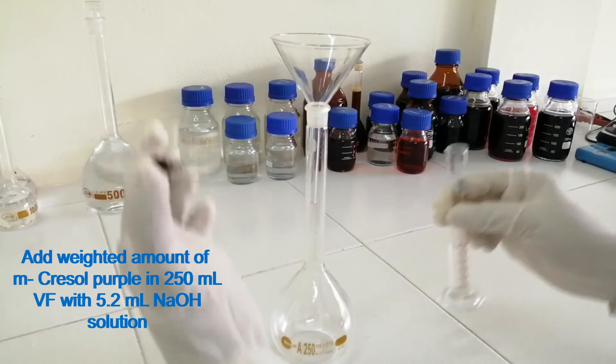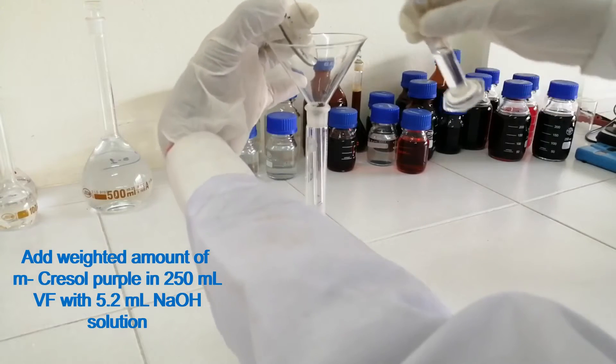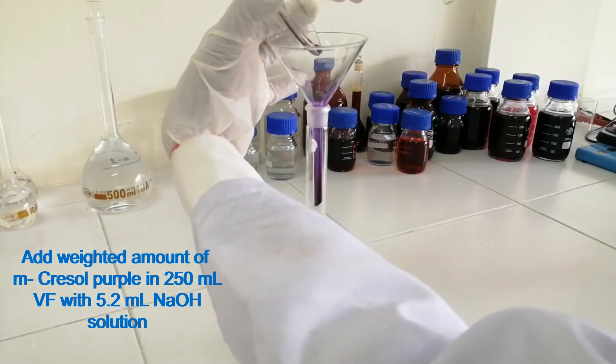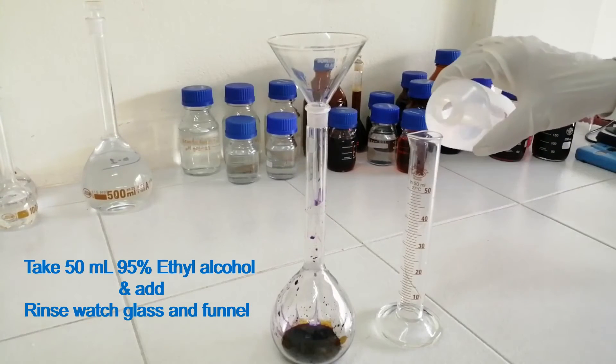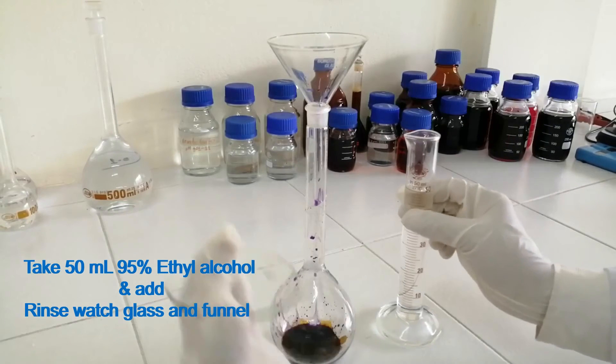Add the weighed amount of metacresol purple into a 250 ml volumetric flask along with 5.2 ml sodium hydroxide solution. Add 50 ml of 95% ethyl alcohol and mix. Rinse the watch glass and funnel.